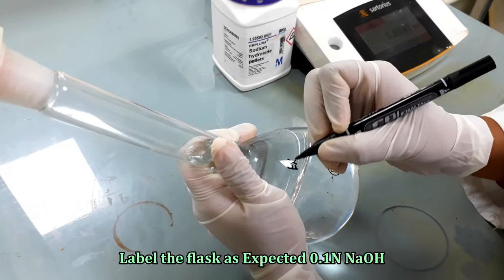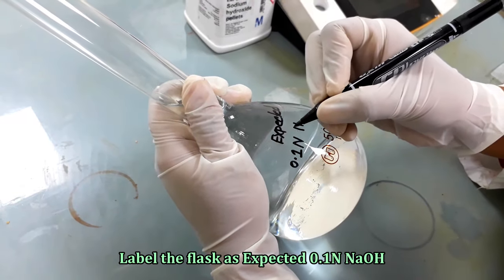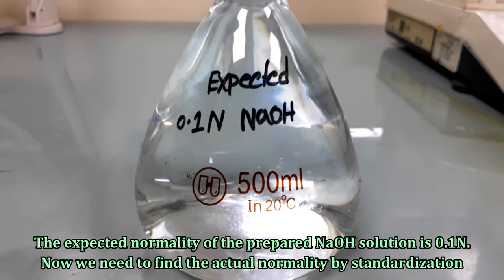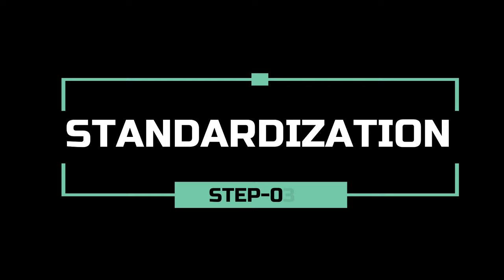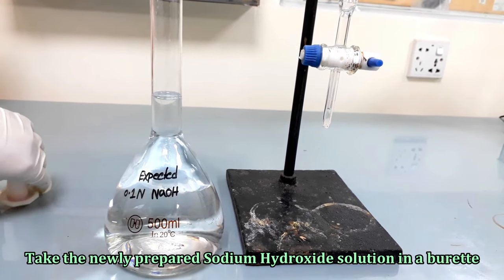Label the flask as expected 0.1 normal sodium hydroxide. The expected normality of the prepared sodium hydroxide solution is 0.1 normal. Now we need to find the actual normality by standardization. For the standardization, take a newly prepared sodium hydroxide solution in a burette.